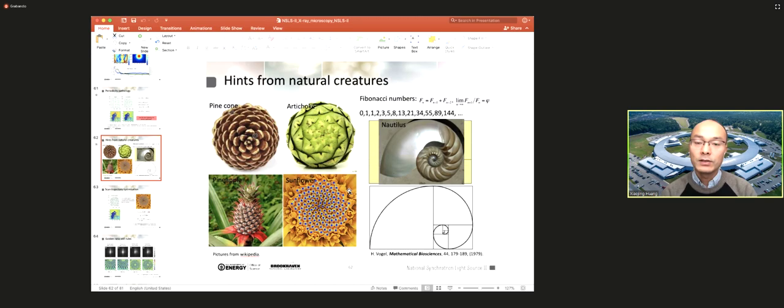So that's the mathematical principle behind it, because this pattern is specially optimized to give each point an equal opportunity to be exposed. Then that means that in the scan, each point is equally overlapped. And that's the reason why it's the best.